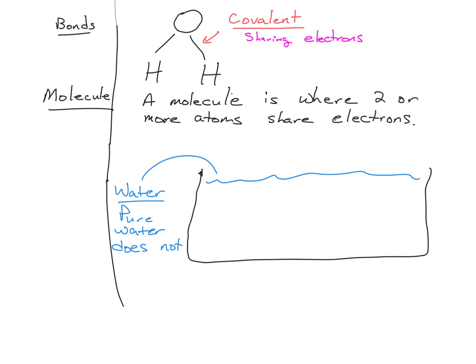Everything good? Yeah. Thank you. Pure water does not conduct electricity. So pure water does not conduct electricity. It's an insulator. It will not allow electrons to flow.